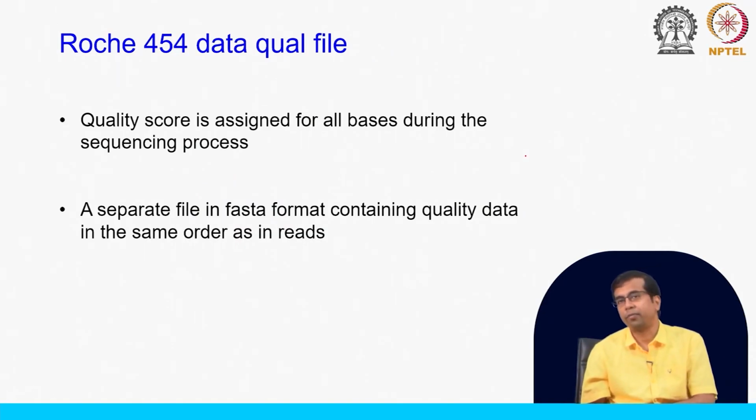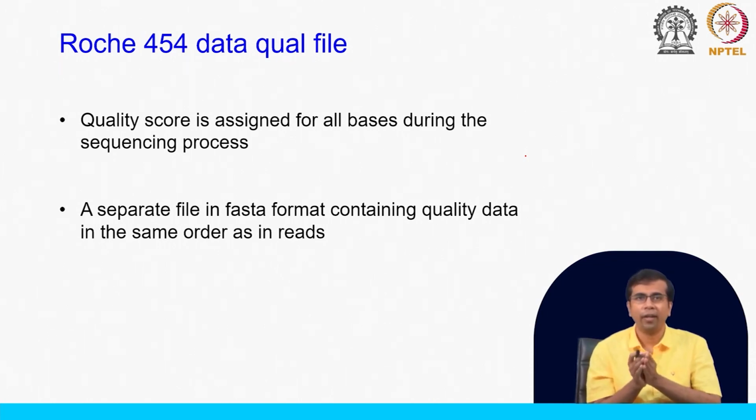Then, once you have the sequence file, you also have the quality score, right. In Sanger sequencing you get the quality score in an AB1 file, right, and since you are looking at one sequence, you can probably manually go and check the quality score for each of them, and maybe you are handling 8-10 sequences at a time in parallel, and that is manageable. In 454 you are dealing with 100,000 reads, right, 100,000 sequences at once. So, you need to put the quality score in some file where you can process them by writing a program, or some software tools can process this quality score.